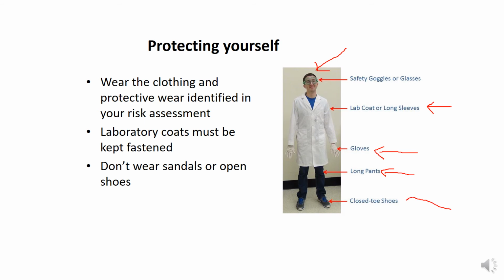And it is really very important to cover your shoes. So it is always recommended while working in the lab to use closed shoes, so that if an accident happens, whether it is a chemical or any other equipment or machinery that falls on your foot, it will not be dangerous. Anyway, these are the normal procedures, but in detail we will discuss PPE, personal protective equipment, in the lectures.